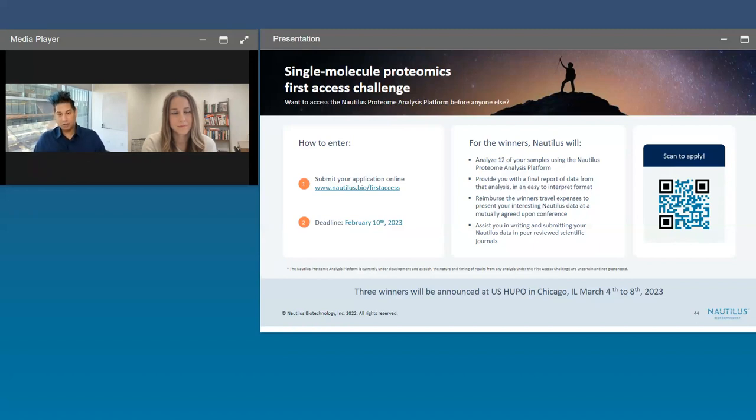Fortunately, our proteins are immobilized, glued down to the surface. And so because they're glued down, you can be extremely harsh in your removal buffers. We often use things like 10% SDS as a removal that is non-protein damaging. It's not chemically active. It's not going to break bonds or damage the proteins, but it'll do a really good job of allowing the antibodies to unbind and get washed away.